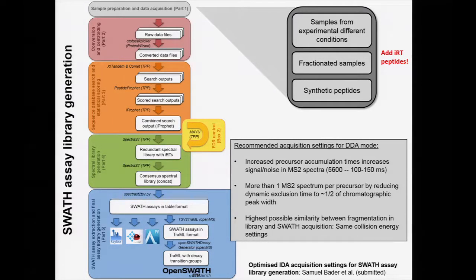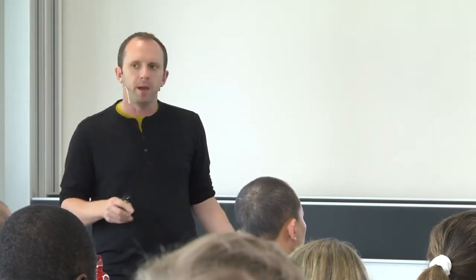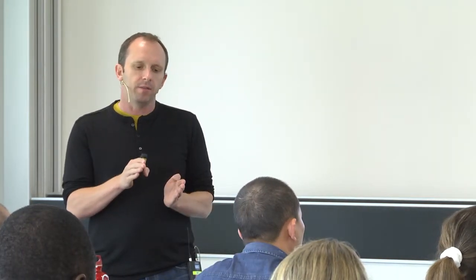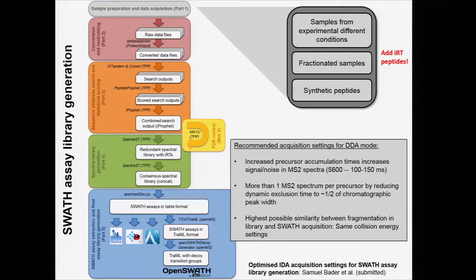And I think this came up already yesterday, but in SWATH, Jared said yesterday, or in DIA, you can't customize the collision energy for every peptide. You know what the mass of the peptides is approximately. You know which isolation window it's in, so it's somewhere from 600 to 625 in that last spectrum I showed, but you don't know what the charge state is, so you cannot exactly customize the collision energy for every peptide, so we have to take a guess about this.